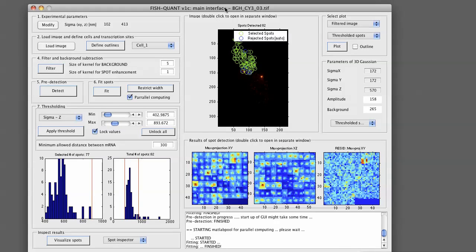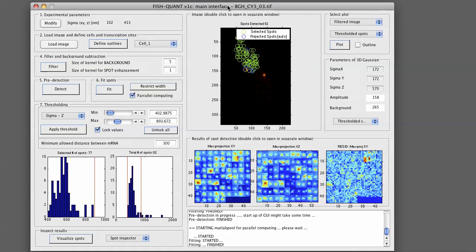In order for that to work you need to have the outlines defined for all of those files and you also have to have the mature mRNA detection settings defined as we already showed in the earlier tutorials.